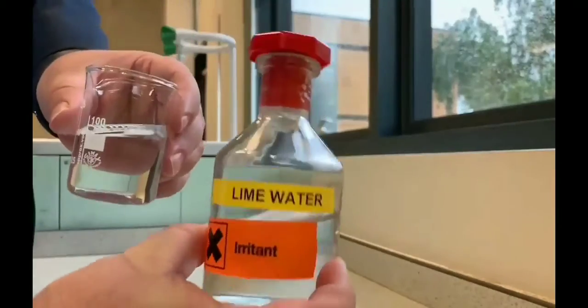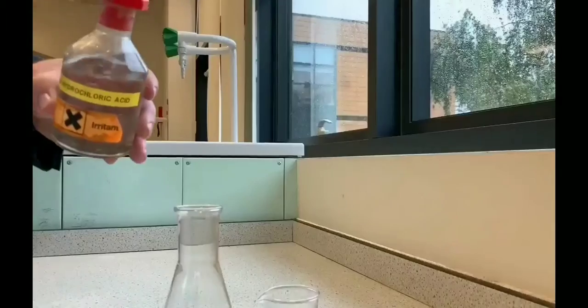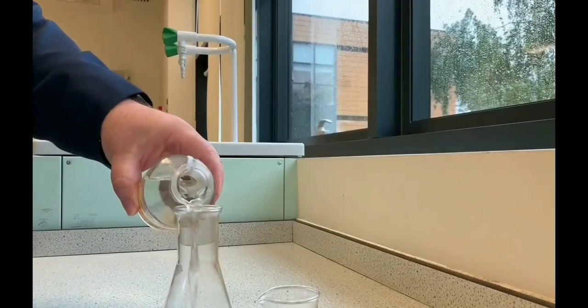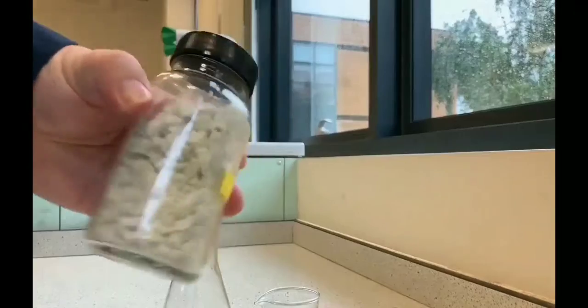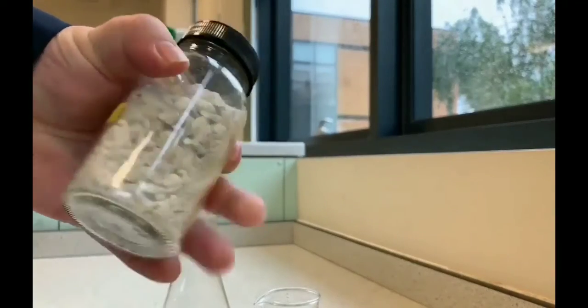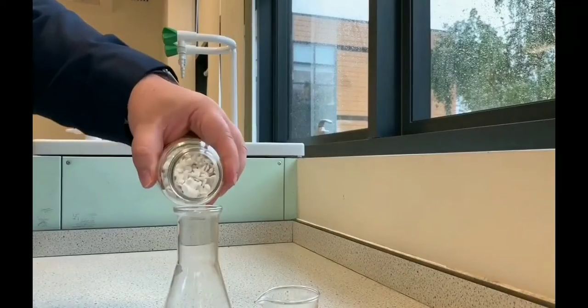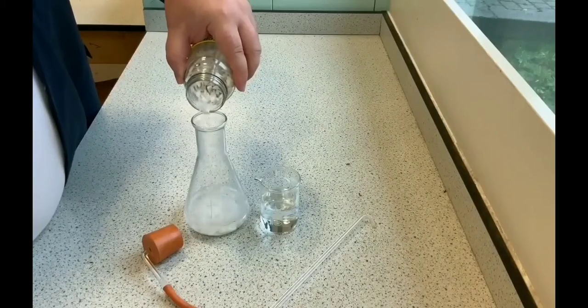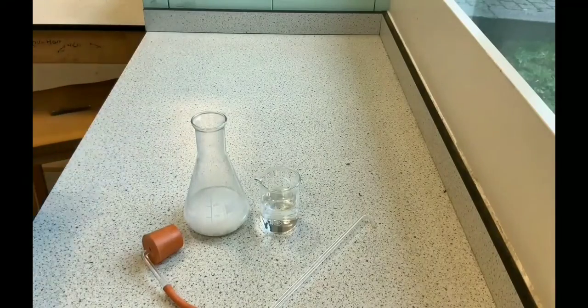Next we've got our test for carbon dioxide using lime water. So if we look here, we can see lime water is colourless. Now to produce carbon dioxide, I've got some hydrochloric acid, and then I'm going to add some marble chips, which is calcium carbonate. As the calcium carbonate reacts with the hydrochloric acid, we should see some fizzing, which produces carbon dioxide gas.